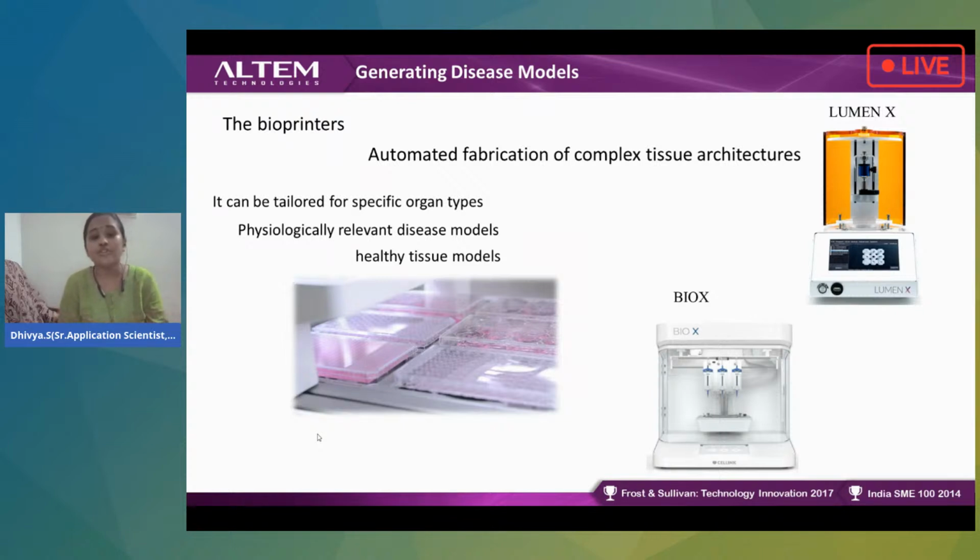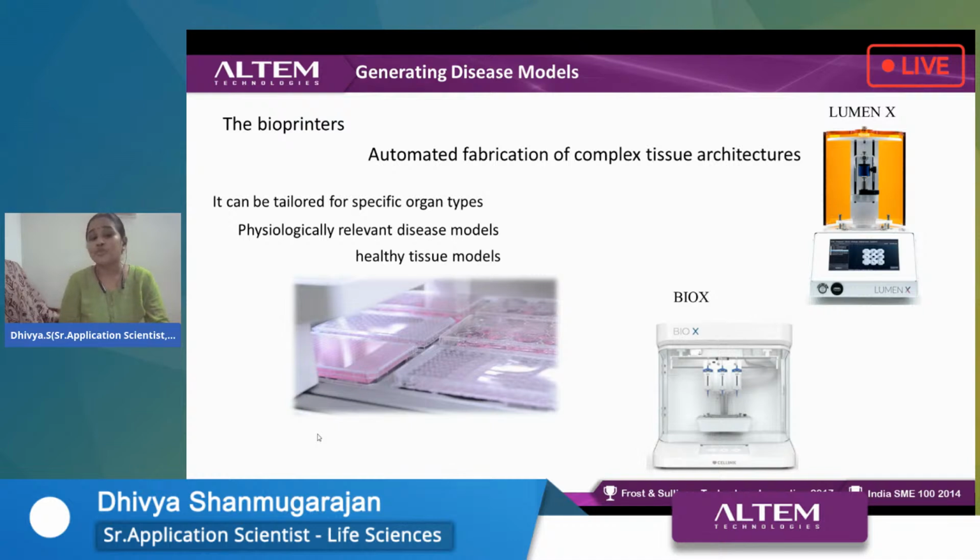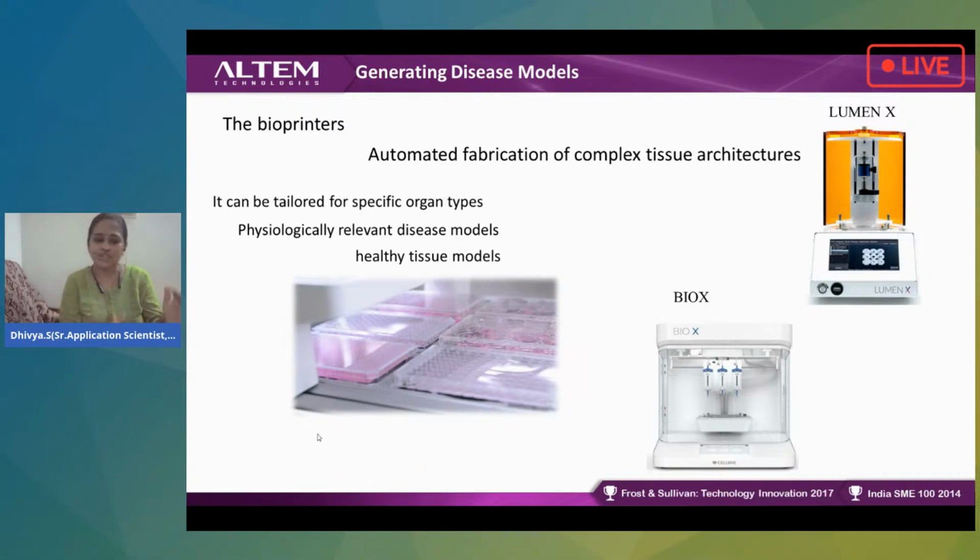But when we do this, we can come to know the live behavior of the cells. At the end of my session, we'll see how lively this technology is capturing changes in the cells day by day, minute by minute, or second by second. And high-throughput screening can be done. I was talking about 1,536-well plates. First, we can start with 96-well or 384-well plates, use a dispensing technology, and print with the bio cells. And you can use this technology to generate disease models.